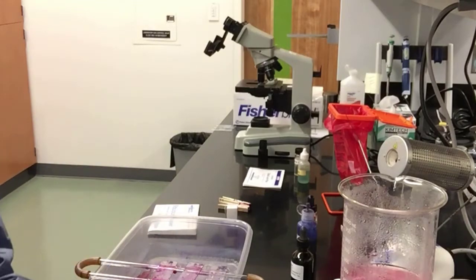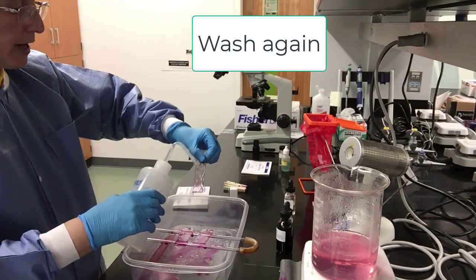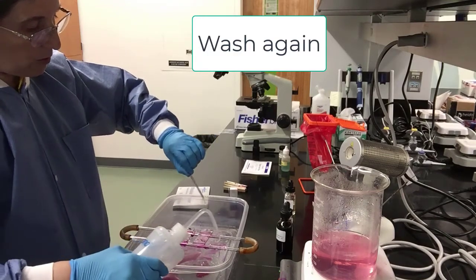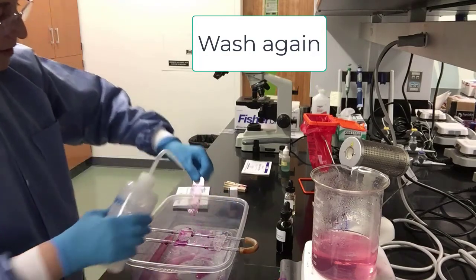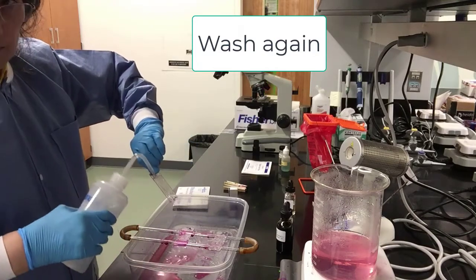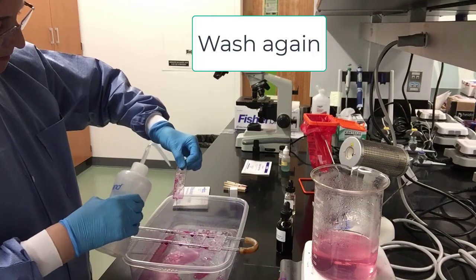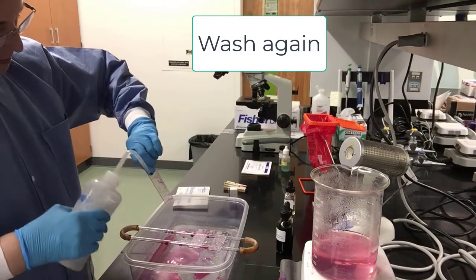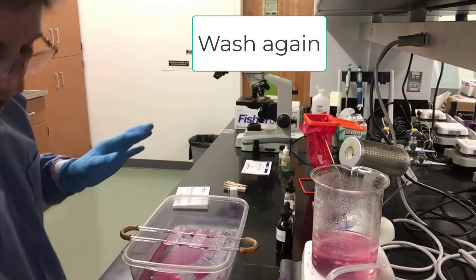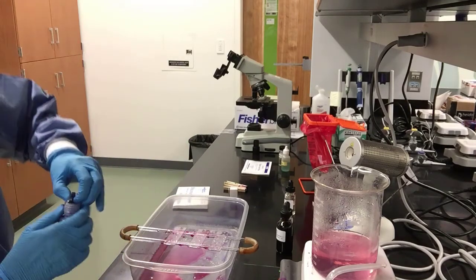We are now ready to do another washing. We wash very carefully, front and sometimes back. Place our slide on the staining rack. Second slide, washing front and back. Third slide, washing front and back. Perfect. So now we are ready for the last step of the acid-fast stain, the methylene blue.